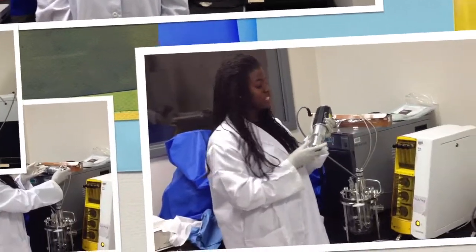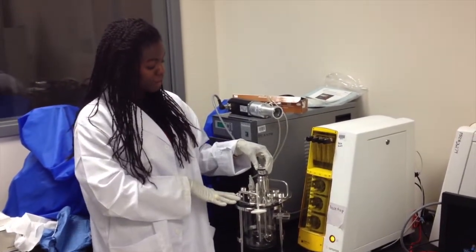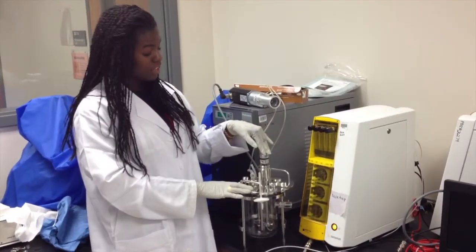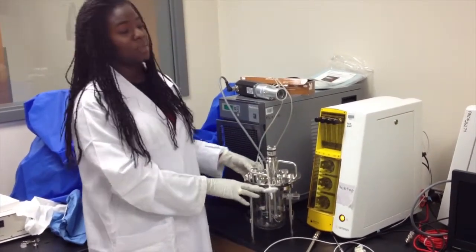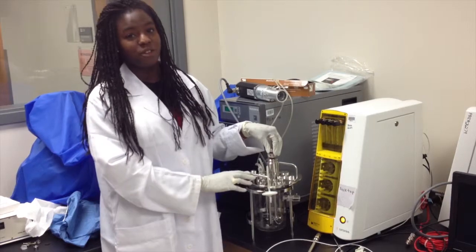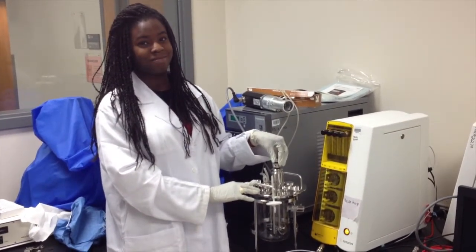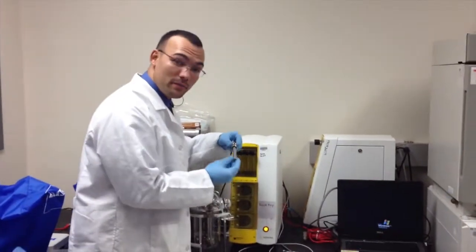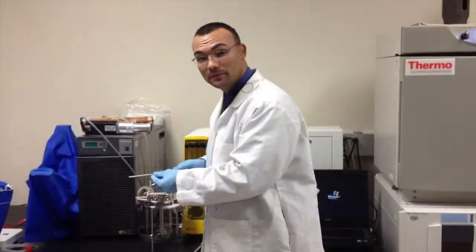For our purposes, we will be using the batch bioreactor, which is connected to this top piece located on the head plate, which is used to power the stirrer. The stirrer mixes the contents within the vessel to supply oxygen and nutrients to the cells at a constant pH and temperature. The three probes used in the bioreactor are the dissolved oxygen probe, the temperature probe, and the pH probe.